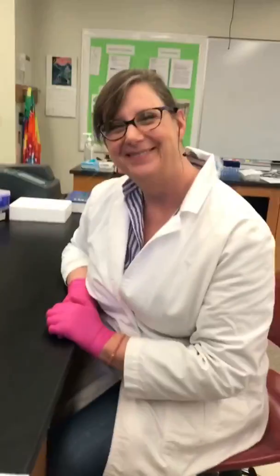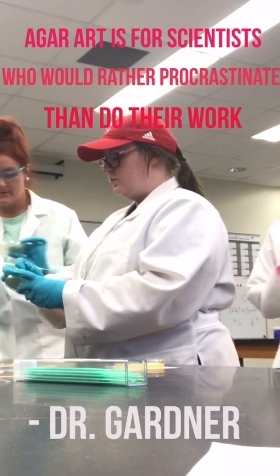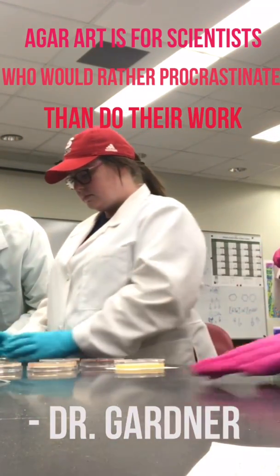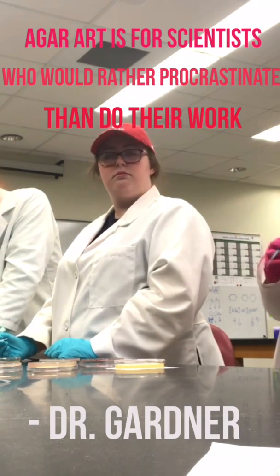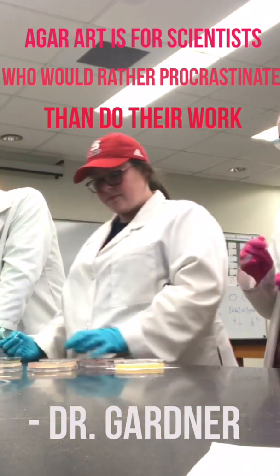Sounds good. We'll try it out. Oh, thank you. But then I have to do it backwards, and I don't think I'm that smart. Yeah, this is actually brain heart infusion agar, but whatever. For some reason somebody stole all my nutrient agar plates, and so this is all we got. But that's fine for what you're doing. I'm sure Serratia doesn't mind brain heart infusion.